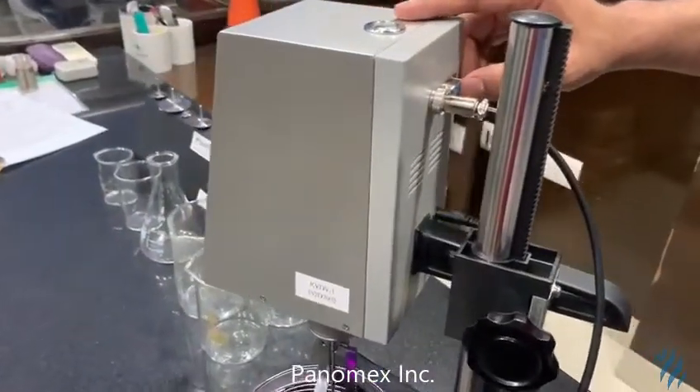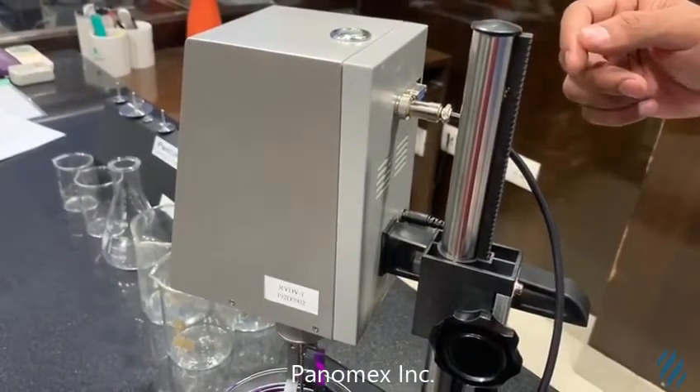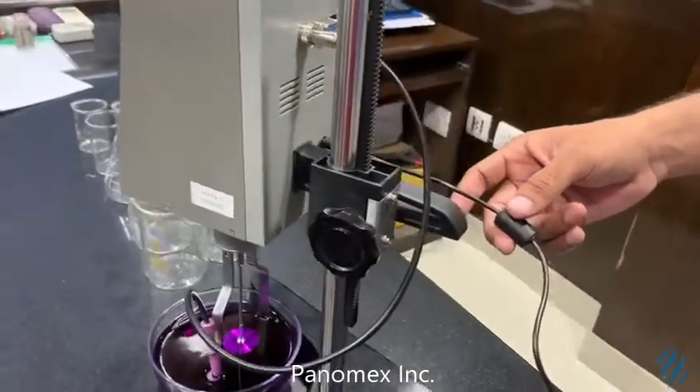This cable is for the RS232 connection. You can connect it and also take out a printout of the data which is present inside this machine. And this is the power.